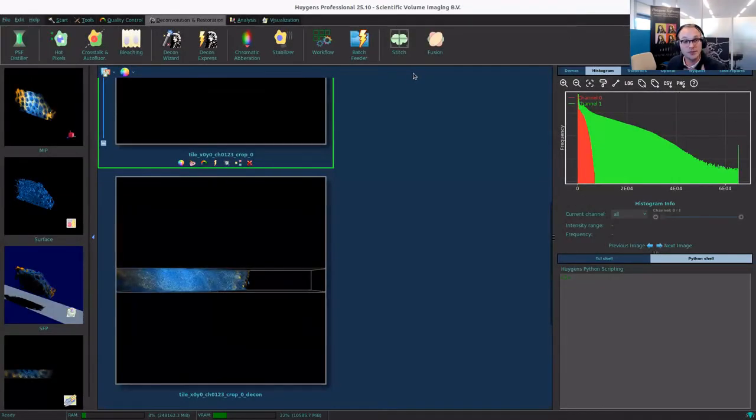Next, I want to show what's new with our pyramid file and big data. With light sheet, the issue is that you have big data, which requires big computers to handle. Some don't have access to such a big computer, and that means they're limited in the size of the light sheet that they can acquire. Others do have access to a big, powerful computer, but that computer often needs to be shared. It's located in one location, and you don't have access to it whenever you want.